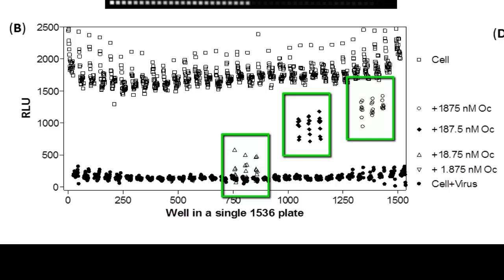So after this is done, we can say the assay development was successfully done, because we have an assay that can clearly tell the significant difference between live cells and dead cells. In addition, if a compound has activity, we can tell that. In other words, if your assay can find hits from our library, this assay has the potential to identify such compounds for you.